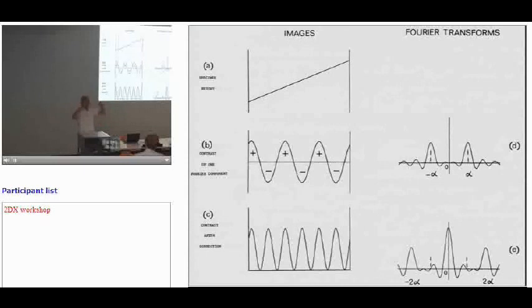The other way is the intersection of spots with the Ewald sphere construction, which have a different Fourier space, and they interfere with the direct beam, and you get these 2. So the beam comes down, the specimen gives diffraction spots out, on the Ewald sphere one is slightly different from the other, they interfere with the direct beam, and you've got the split spots.